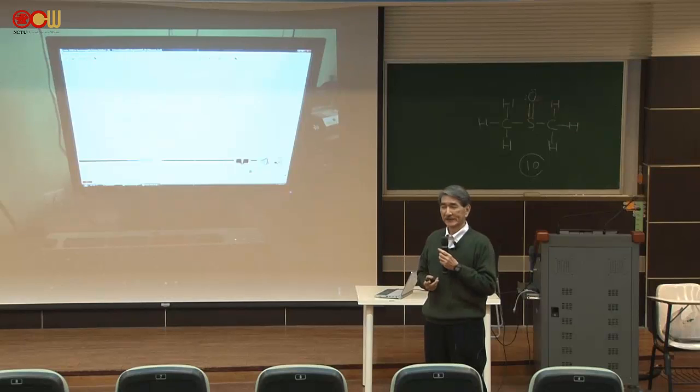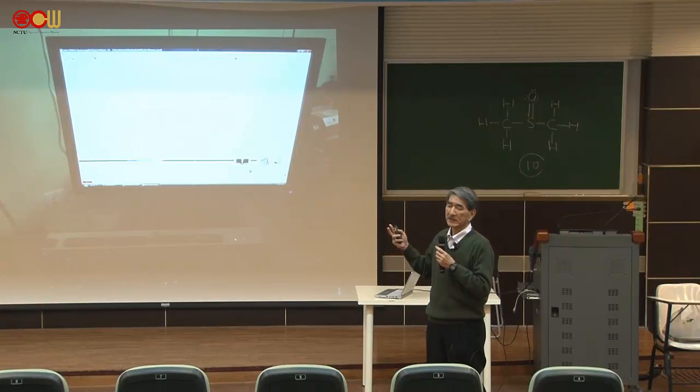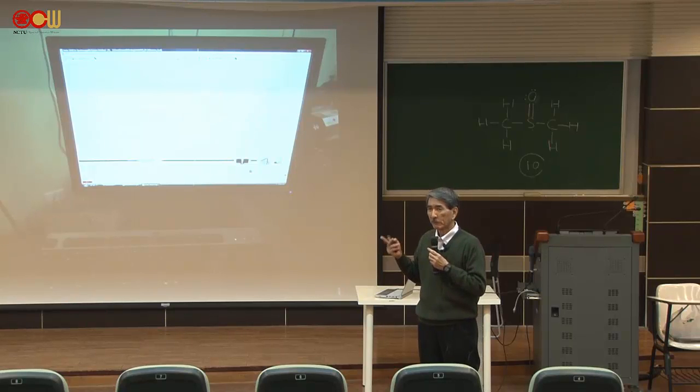You can never buy that. If you buy commercially available apparatus, maybe the quality is much lower than what we have here. So it is very important to make everything by yourself. Okay? So what we do here is real state-of-the-art and world-leading Raman spectroscopy here.